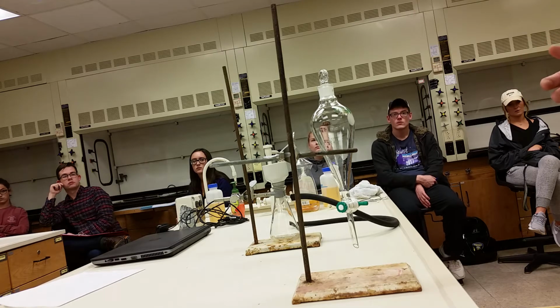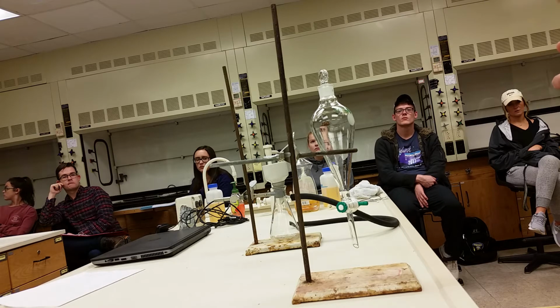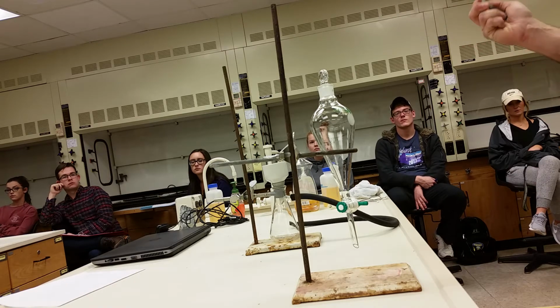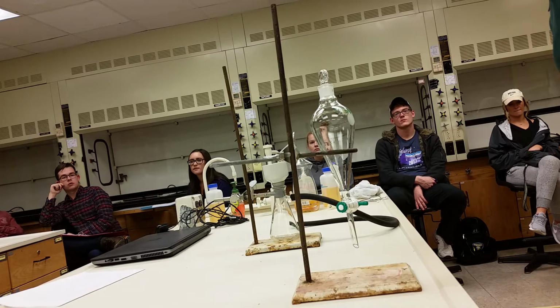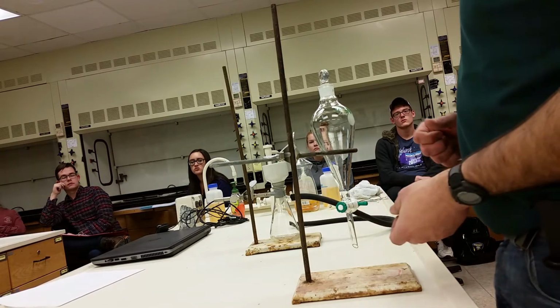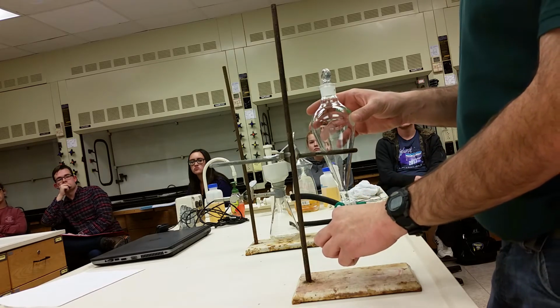It's sort of like a Goldilocks story. Okay? Can't be too small, can't be too large, it has to be the right size to hold your separatory funnel. Connect this to the ring stand. Leave yourself space so you can get a 125 milliliter Erlenmeyer flask underneath the separatory funnel.